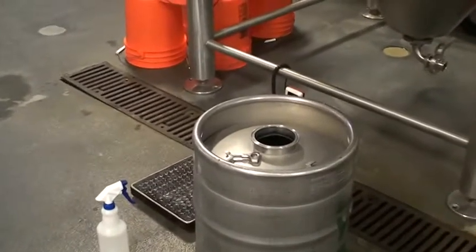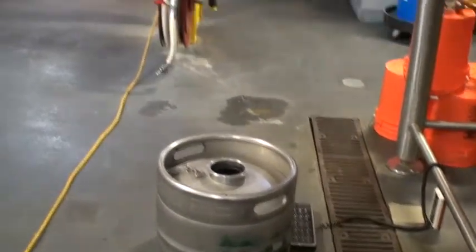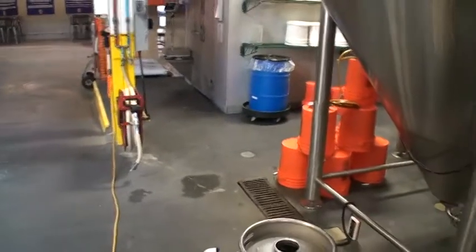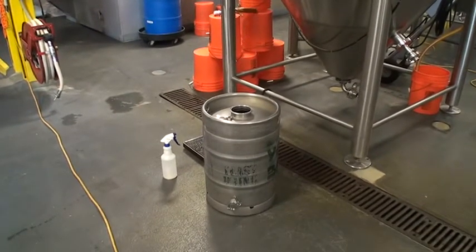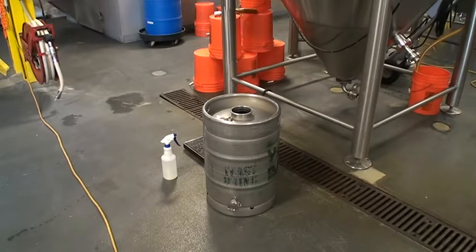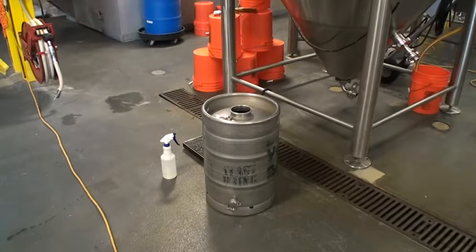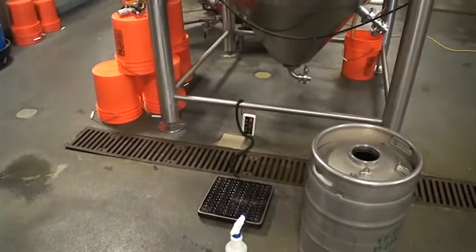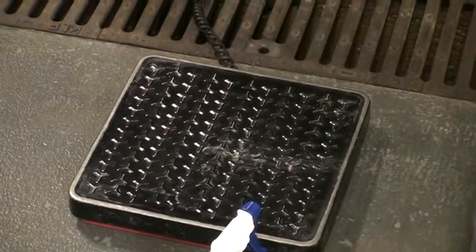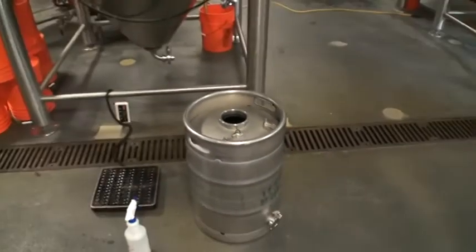Yeast brink. I think it says yeast brink on here. Yeah, right there, yeast brink. These are very important. Every commercial brewery has some of these, whether they're doing it in-house and collecting yeast for themselves to repitch or sharing with another brewery. This is a great way to get it in there. And what we're going to talk about in just a moment is the scale. That's this part over here. So we're going to do yeast by weight, not volume. That's what we talked about in the previous video. And that scale is going to give us a reading as we start transferring good yeast into the brink.